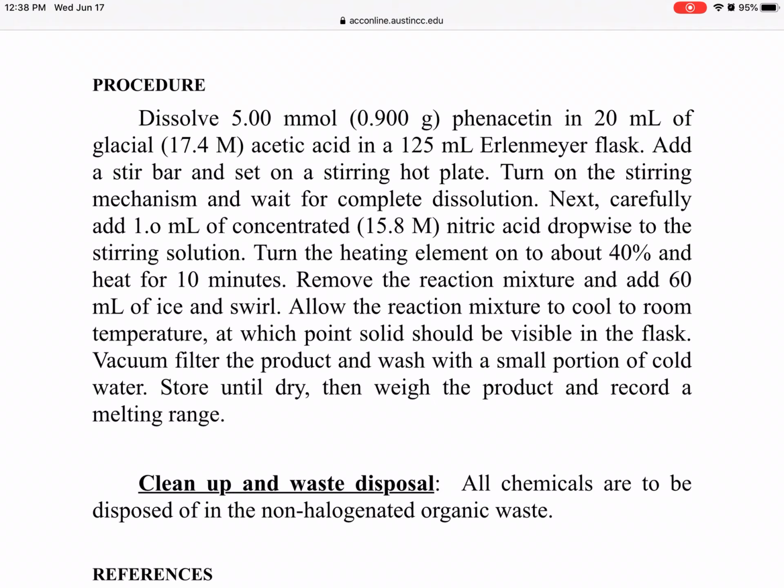As the temperature comes to normal room temperature, the solubility of the solid becomes less, so you will see crystals start forming. Crystals of your compound will form, but any impurities that were soluble when you heated it will remain soluble, so they will not reform as a solid when it cools down.